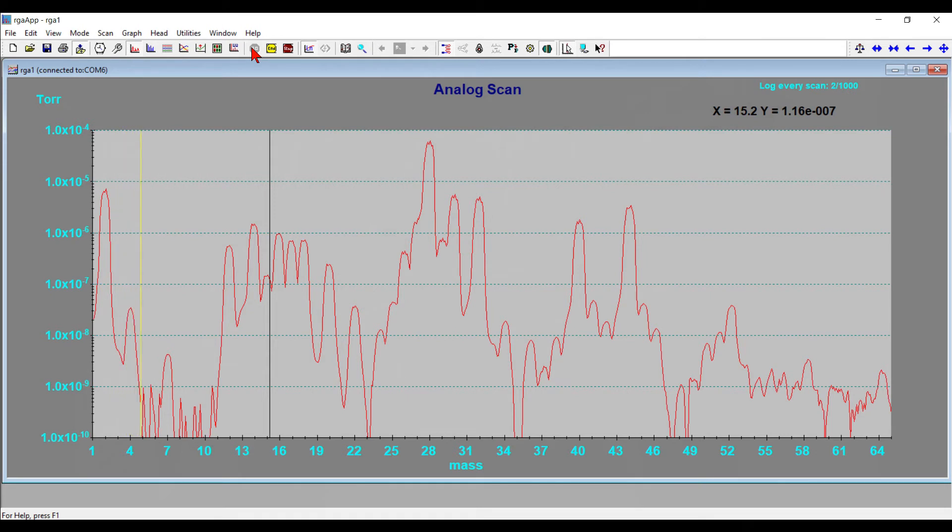I've turned on the SRS100 controller and opened the RGA software and started a wide scan to make sure that the RGA is working properly. The RGA uses a tungsten filament to ionize the gas in the chamber, and since my vacuum is in the 10 to the minus 6 torr range, it's safe to operate the RGA.